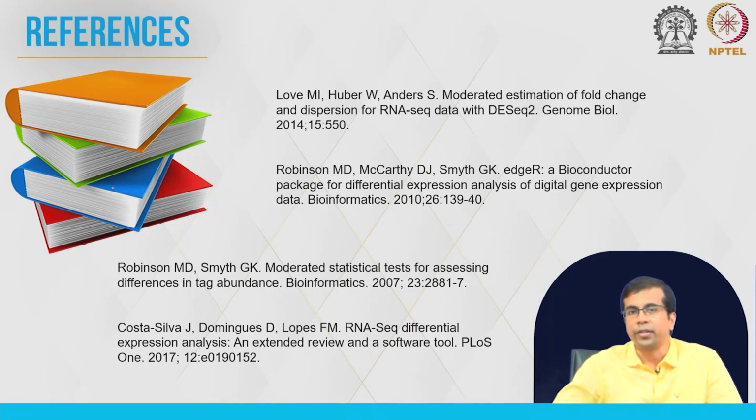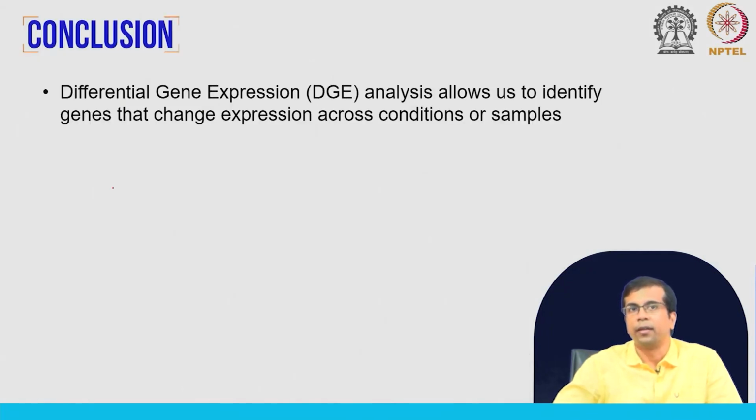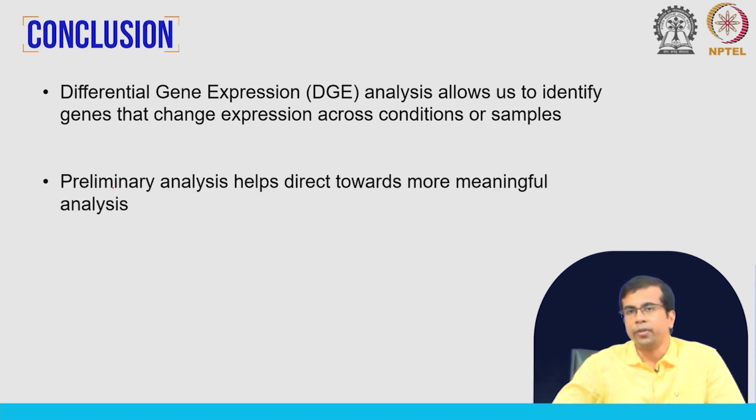So, here are the references for this class. To conclude, we have seen that differential gene expression analysis allows us to identify genes that change expression pattern across different conditions or different samples. Here we took examples of disease versus healthy, and we have also talked about some of the preliminary analysis that can help us direct towards more meaningful analysis.